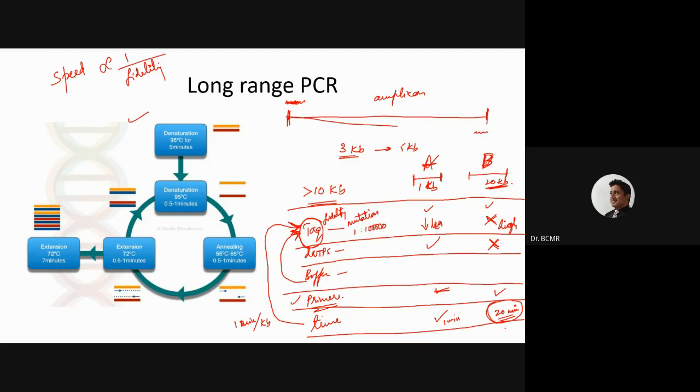The faster we tend to work, the more likely that we might make a mistake. The same is applicable to the majority of DNA polymerases too. Taq polymerase has great speed, but its fidelity is a little bit compromised.